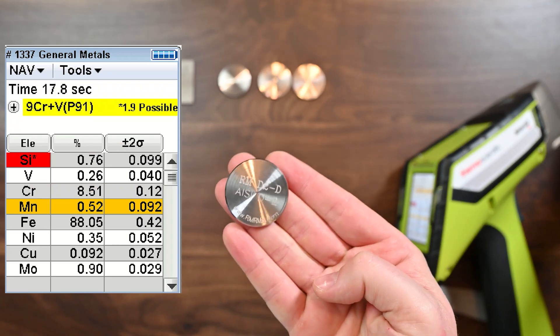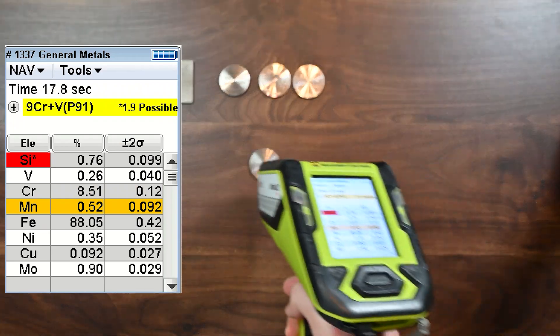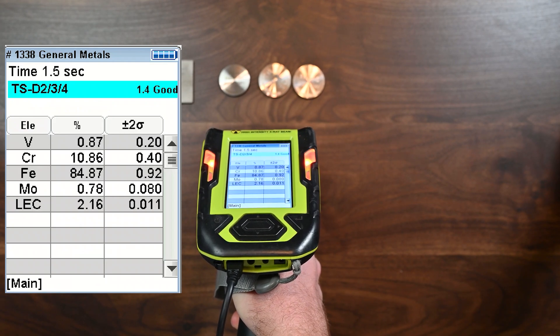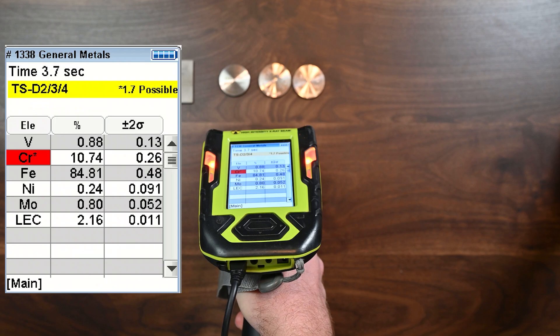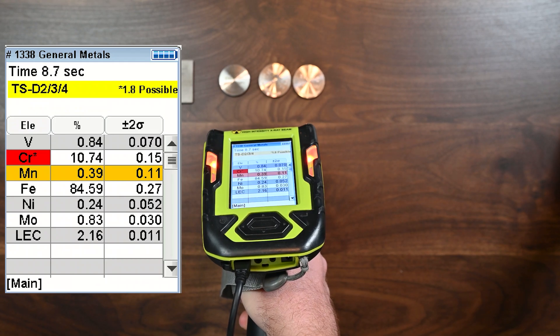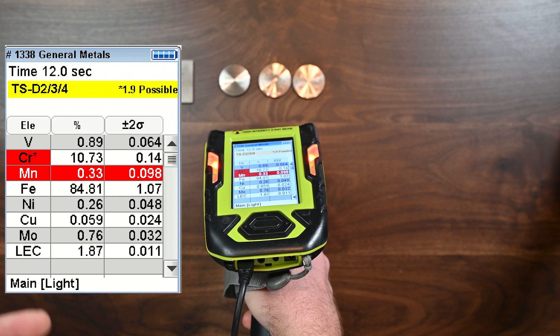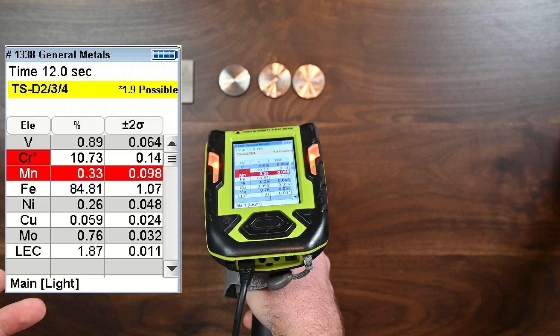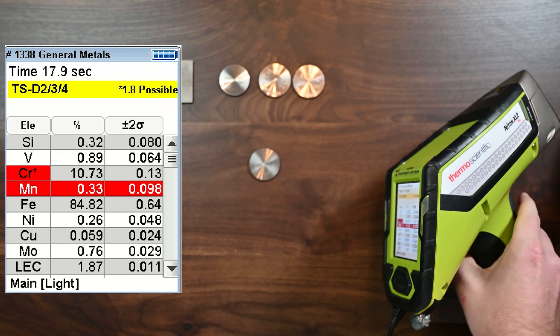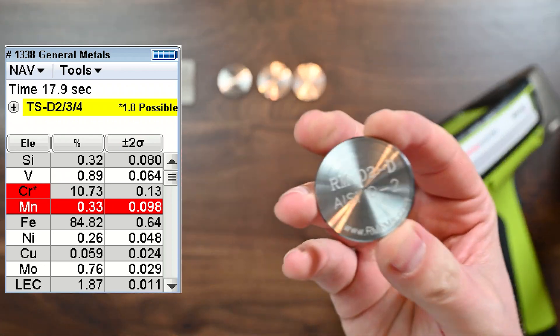Instead, I wanted to do this D2. So this is a tool steel and you find these tool steels around lots of machine shops and dye shops, things like that. And they're incredibly useful alloys. So let's see if it gets this one right. Now this one, I do have the certificate for. So what we're going to do is we're going to let the light element beam come on and then we're going to take a look at the chemistry and kind of see how close we got. But I'm just impressed. I'm always amazed with how fast this analyzer gets the grade identification, right? And usually that's what you're really looking for in the field is that grade identification. What I'm doing now is more of a chemical analysis after the fact, and it's not necessary. That one second grade analysis, if you get a good match number, it's going to be good every time.